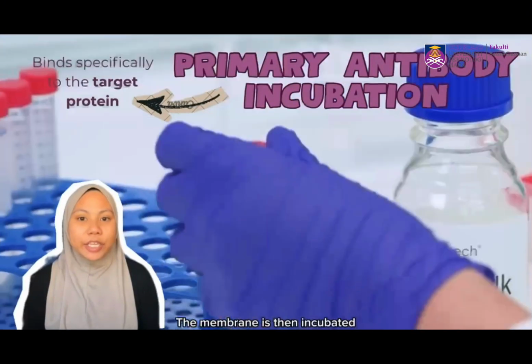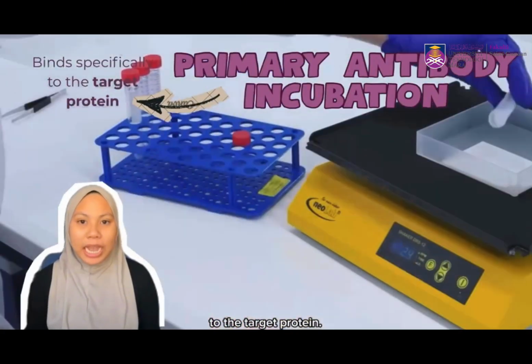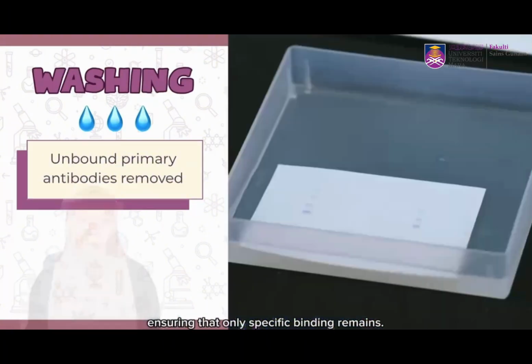The membrane is then incubated with the primary antibody, which binds specifically to the target protein. After that, the membrane is washed to remove any unbound primary antibodies, ensuring that only specific binding remains.